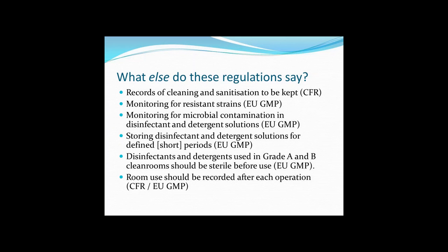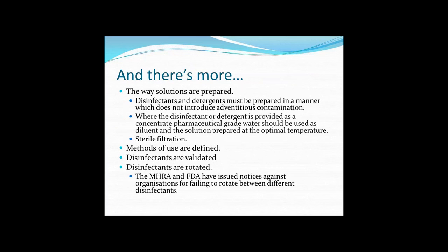And unfortunately, the list of regulations stretches on. So there's also a requirement to define how solutions are prepared. And the regulations stipulate that disinfectants and detergents must be prepared in a manner which does not introduce adventitious contamination. So that's cross-contamination from the environment or from a person.